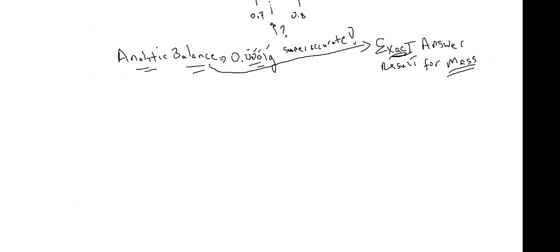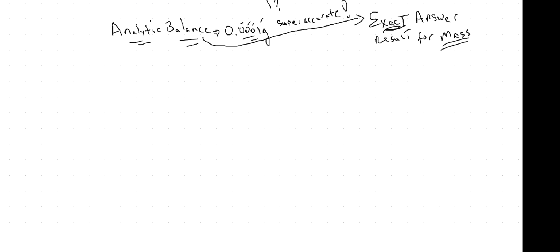The second thing I want to talk about right now in terms of the lab is temperature. So temperature and temperature scales.